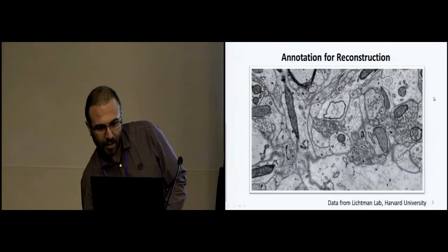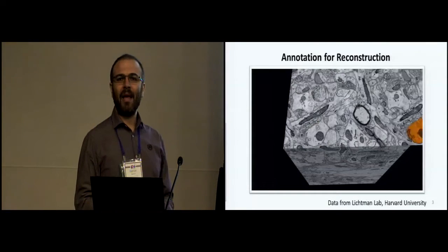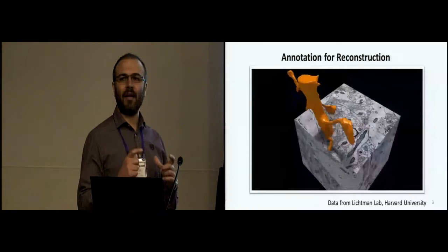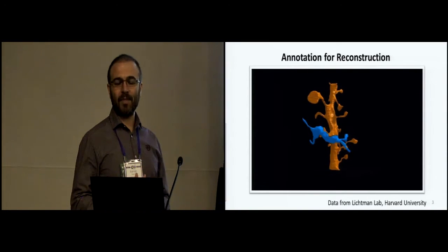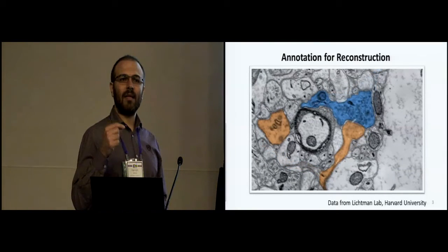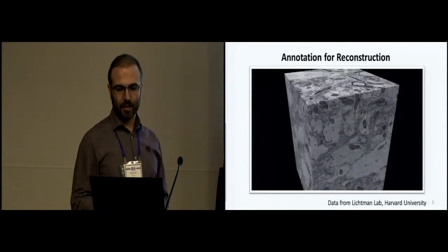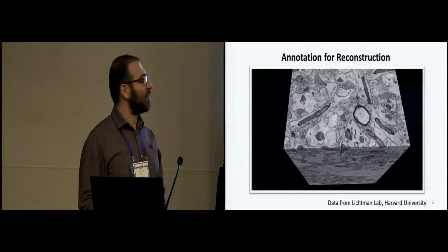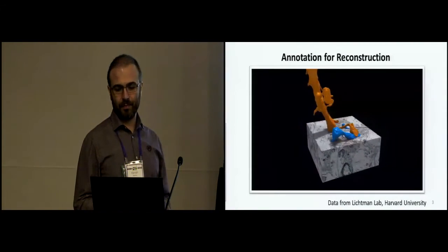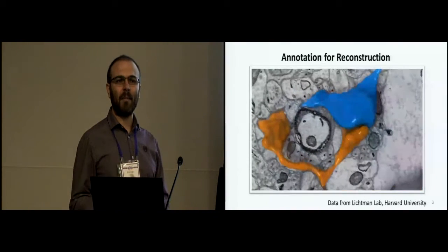What they do is take a small piece of brain tissue and cut this tissue into very thin slices. From each slice, they take an electron microscopic image, and they end up with a 3D image stack, a volume of images. After that, they need to annotate the corresponding cross-sections slice by slice and link these tubular objects. This operation is mainly done by manual input and semi-automated annotation systems. The domain is called connectomics, and it is a sort of brain mapping process.